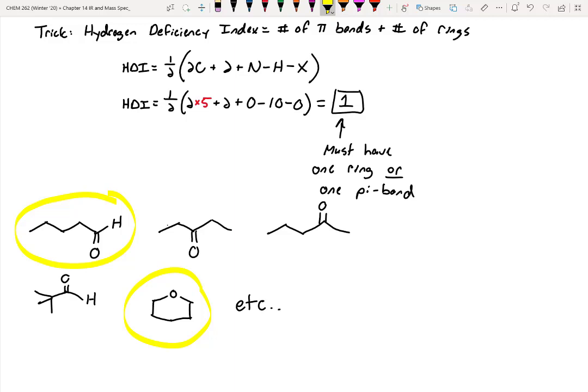So like I said, I always treat it like a court of law. We can't always just go in with the mass spec and say, all right, we've won the case. Oftentimes you need mass spec, you need IR, and then we'll learn about NMR later on. We have to use as much evidence as possible to present our case, because sometimes, like you've seen with IR, it can be confusing. Sometimes mass spec can be confusing, but together they're less confusing. So we can use them as additive tools for deduction.